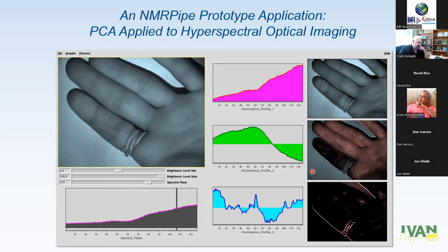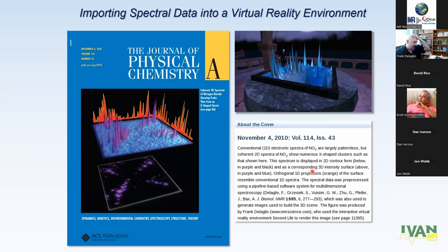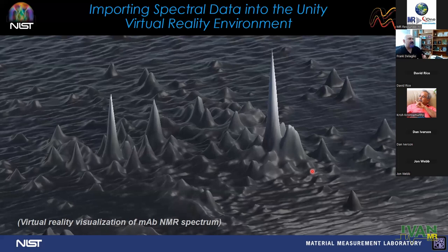Something else that we've kind of done in part for fun is build tools that will import spectral data into virtual reality environments. And we started to do this work more than a decade ago and did one or two useful things. And we're in the process now of doing it with actual virtual reality headsets as an environment to visualize spectral data and molecules. So stay tuned for that.